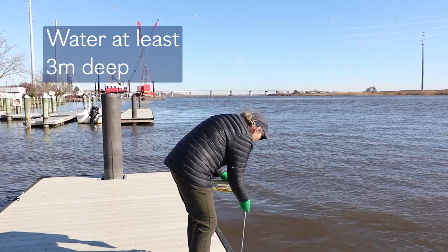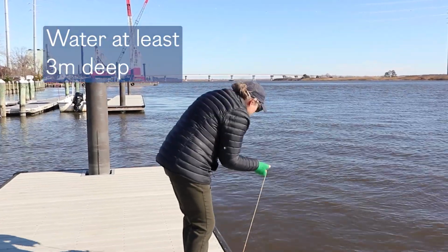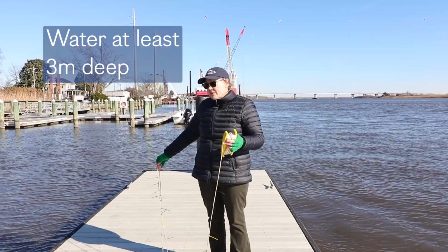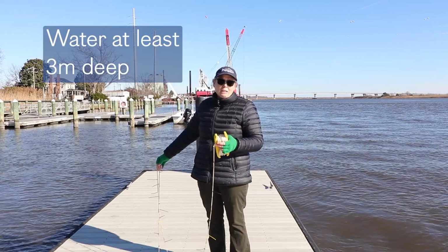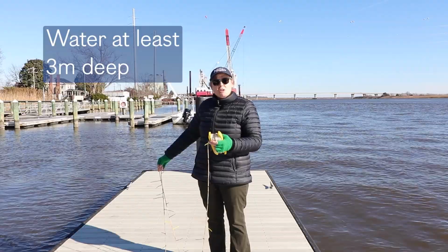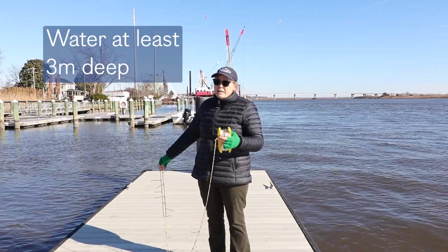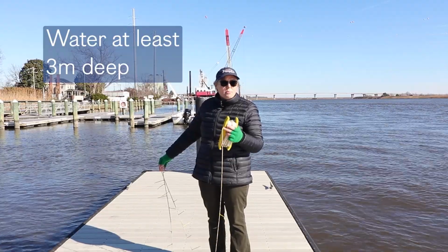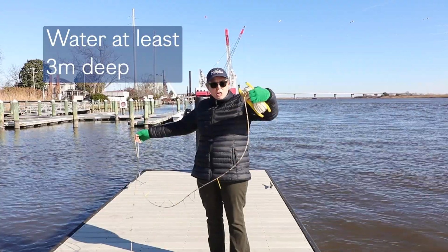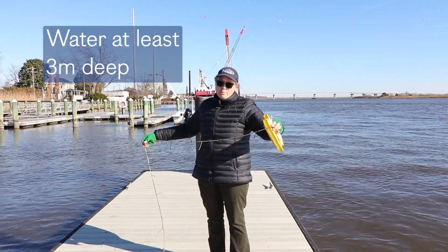We do have some sites that are deep water sites, and what that means is that the total water depth is at least 3 meters deep. If this is the case, then you're not only going to take a surface measurement, a bottom measurement, but you're also going to take measurements at 1 meter increments at any point where you know the probe is not going to hit the bottom. Here in Vienna, we just measured a 4 meter total water depth.